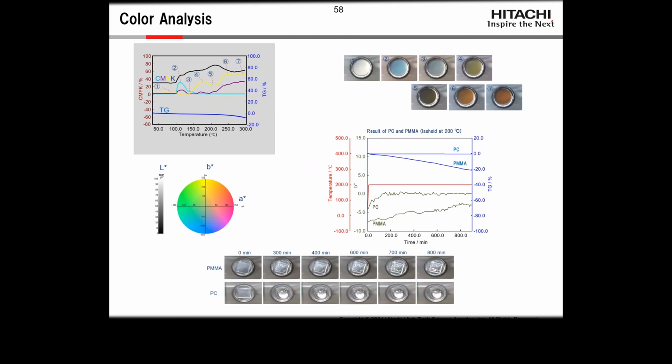We can also, and this is something that I find really cool because I'm partially colorblind, look at color analysis. When you're looking for the start of oxidation in a material, where it begins to turn yellow, operators are going to see that at different times. In the series of data on the bottom, my boss can pick it up a whole lot faster than I can. We can actually use the color analysis to tell us where the yellow is increasing and how that's happening.